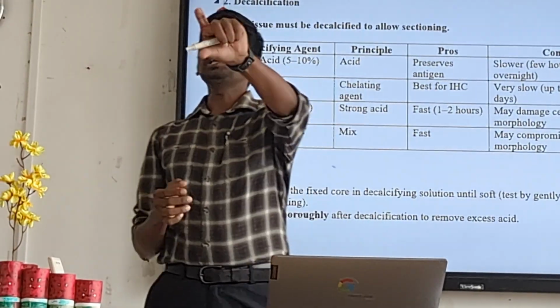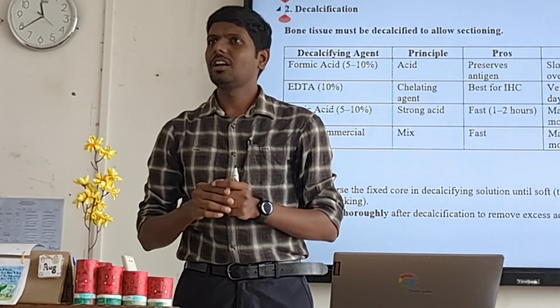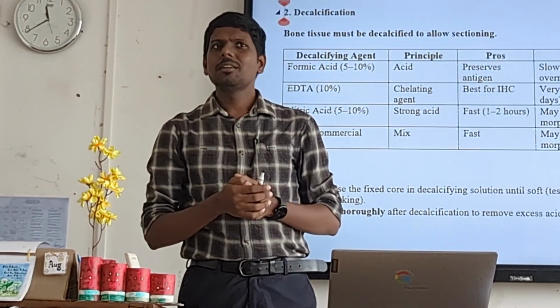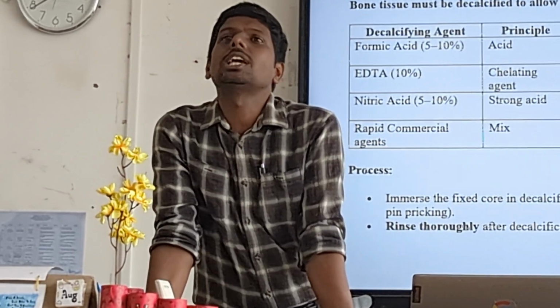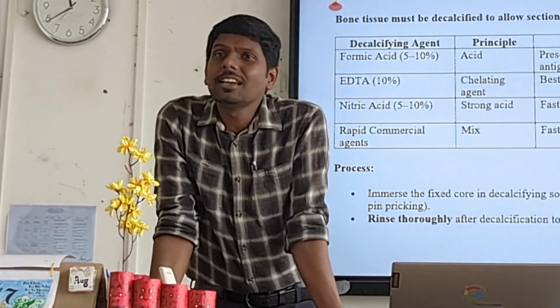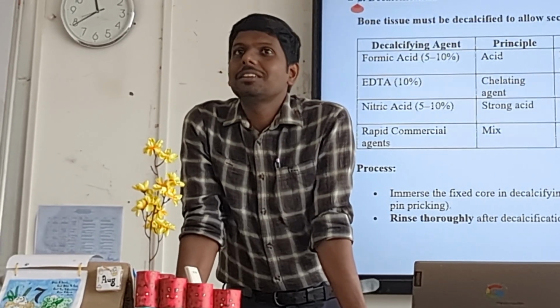They are saying that take an EDTA solution, keep the bone sample in it, and it will decalcify. How? We know that EDTA is an anticoagulant. But how can EDTA do decalcification? Can you guess? How can EDTA achieve decalcification? Is my question. What is the other name of EDTA? It is also called a chelating agent.